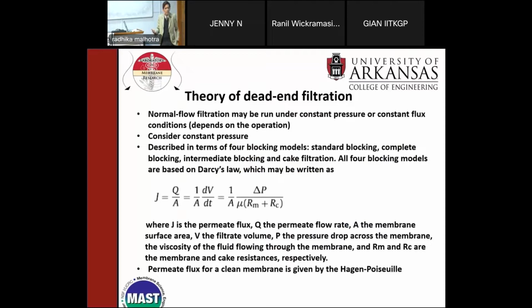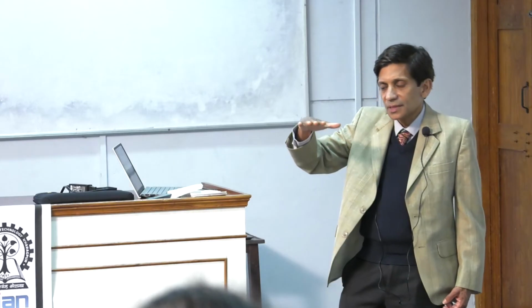What do I mean by that? So you know a depth filter, right? I've shown you a depth filter. You have everything comes in, everything is retained. The flow outside is just the product. I can run this so that I apply a certain pressure driving force at the top, and that's a constant pressure. So if I run at constant pressure, what happens? Eventually, the filter starts to plug, right?